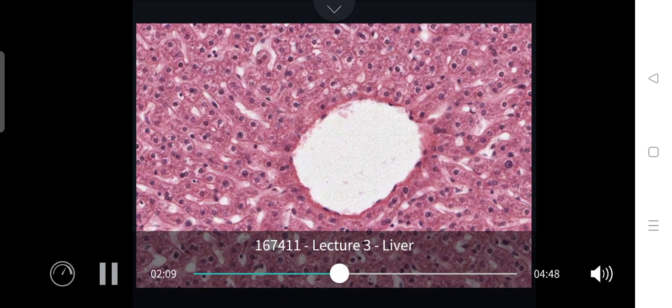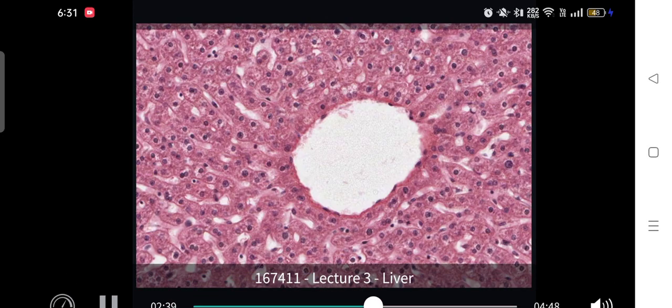The parenchyma is composed of irregular lines of hepatocytes, which look like cords of cells. The real arrangement in 3 dimensions is that of anastomosing sheets of cells. Between these sheets are blood sinusoids, with the flattened nuclei of the cells lining them. They belong to endothelial cells and to Kupffer cells or macrophages.